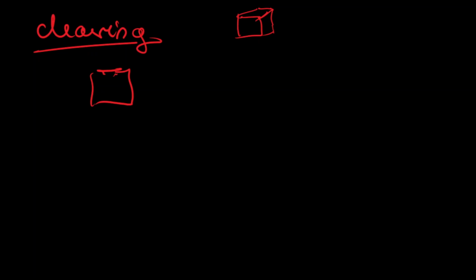In order to slice this tissue block, we don't want it to be soft, because if it's too soft and we are trying to slice it into very thin slices, we have chances of the tissue just cutting or whatsoever the case may be. So what the paraffin embedding does is that, as an end result, it helps to make the sectioning easier.